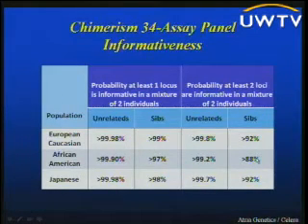Your chances of finding 2 SIBs that have at least 2 informative loci drops now to 88%. And I can imagine it drops even more dramatically if you start asking for 3. So this is not, as I said, anywhere near as powerful, at least if you're looking at related individuals. If you're looking at unrelated, it's not so bad, because you're still at 99% probability of finding loci that are informative.